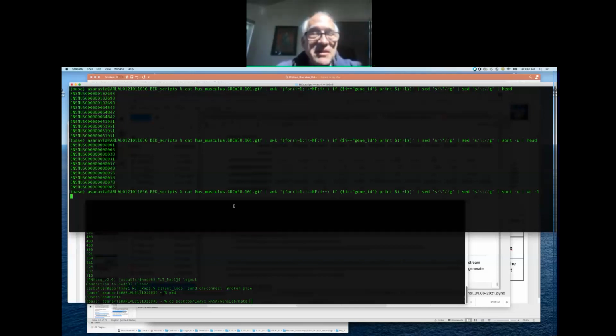And in my experience, of all the things you can put in a pipe, sort is the one that's most likely to slow it down, because to sort n things, the amount of time is proportional to the square of the number of things. Everything else is pretty much linear. So that's why I figured I'd have time to say this while we're waiting for the sort.